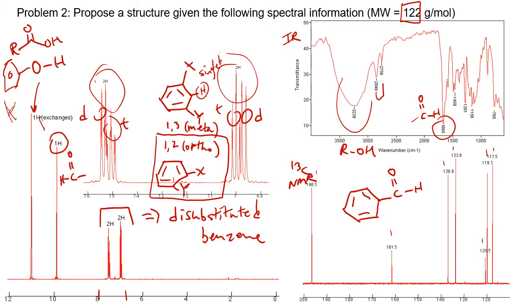And if we think about our aldehyde, how many carbons does this have? 1, 2, 3, 4, 5, 6, 7. Well, we have 7 carbons already, so it must not be the carboxylic acid. The other group attached to this must be just a simple OH. Because now this structure has 7 carbons.